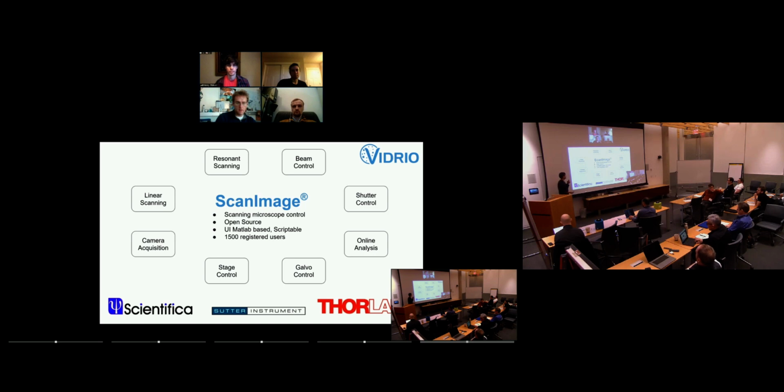Okay. So ScanImage has a lot of stuff that you can do, right? We do linear scanning, we do resonance scanning, we control Pockels cells, shutters, we do online analysis. Obviously, we control galvos and resonance scanners, we control stages and cameras. So in some sense, we have similar requirements as Micromanager, and I think we come across the same issues in many ways.